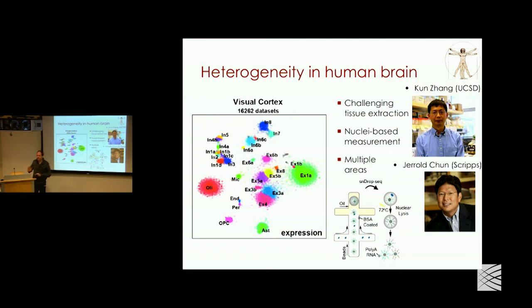Now, strictly speaking, from the biology textbook, you would expect most mature mRNAs to be in the cytoplasm. So if you come in with a poly-T primer to fish for mature RNAs in the nucleus, you shouldn't get much. But it turns out you get quite a bit. Now, it's obviously a biased sample. I'm sure there are some transcripts that are policed very well and sit entirely in the cytoplasm. And it's also probably biased towards things that are currently being transcribed and so on. But again, what we're trying to do is classify cells, and given how big the actual measurement space is, we can do reasonably well.